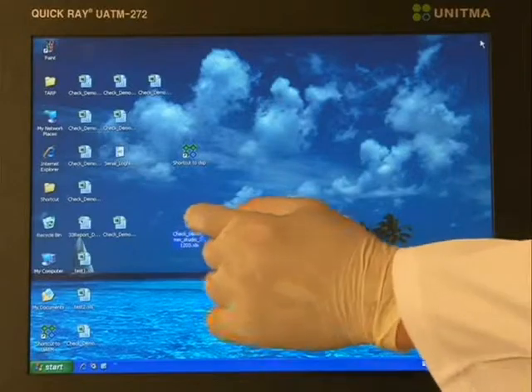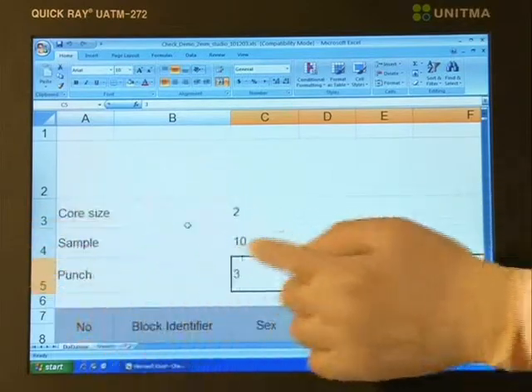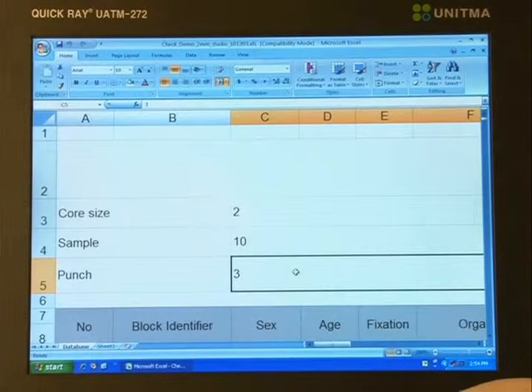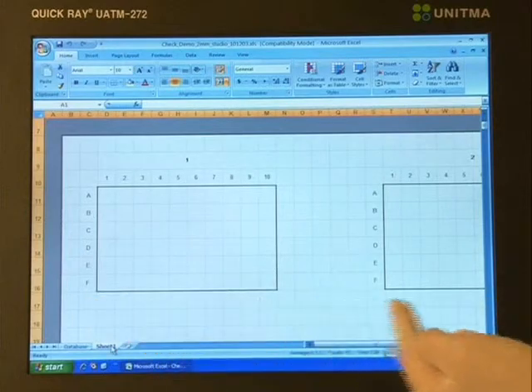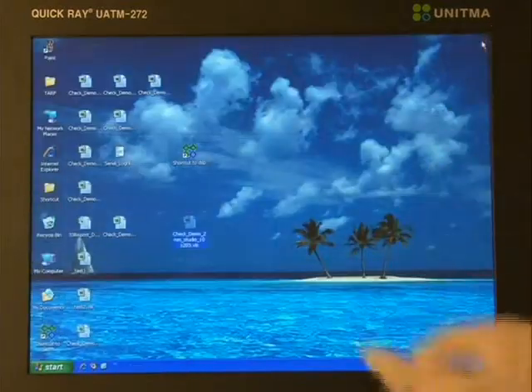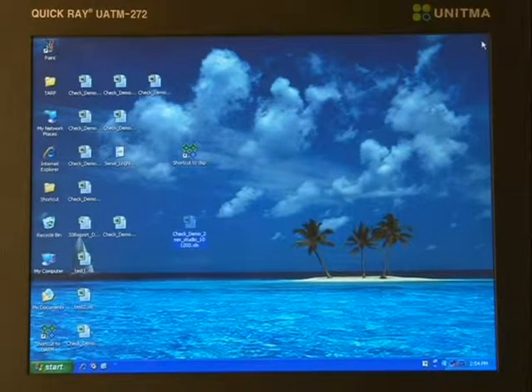This automation is available with only 3 parameters of TARP, Tissue Array Report Program: the core size, number of donor blocks, and number of tissue samples in each donor block. After this work is finished, the information on the donor block that was inserted into each recipient block hole of the TARP file is renewed and saved. This TARP file in Excel format can be used in various ways.